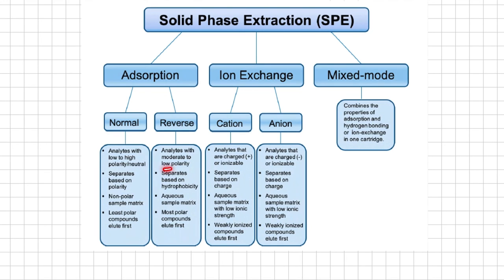In reverse phase, analytes with low or moderate polarity are used. Separation is based on hydrophobicity. The aqueous sample solution is the matrix, whereas the most polar compounds will be eluted out first.